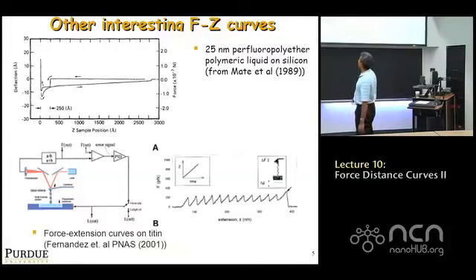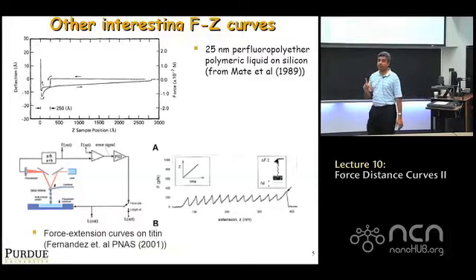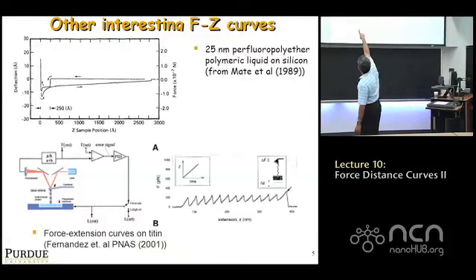Right? But again, you have to be careful, because it's not really vertical, because if you look at the axes, the y and x axes, it turns out, I'll give you a hint, that the end part of the slope, which looks nearly vertical, its slope in terms of deflection versus sample position is actually 1. It's just the scale is weird, because the x-axis is thousands of angstroms, y-axis is 10, but really the slope there is 1.